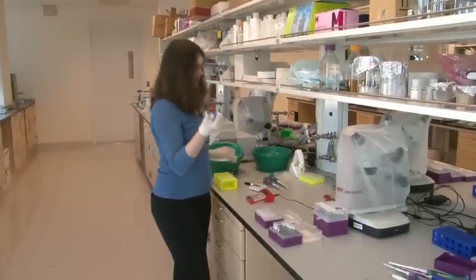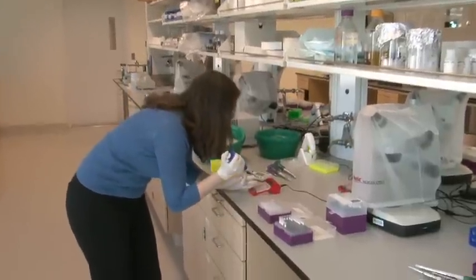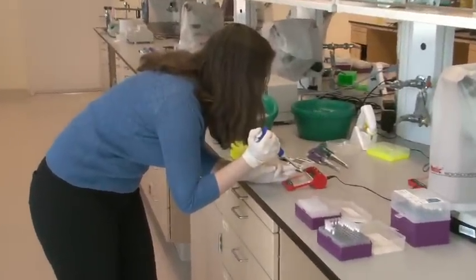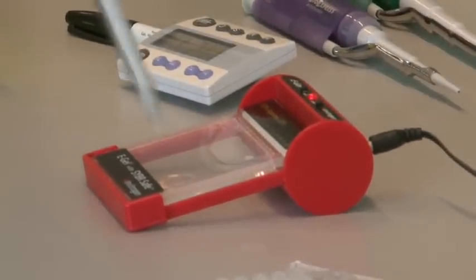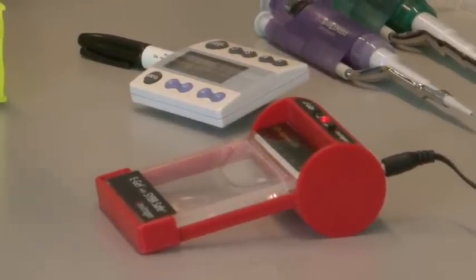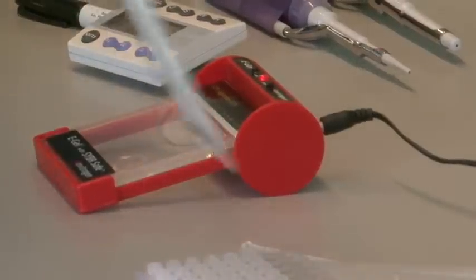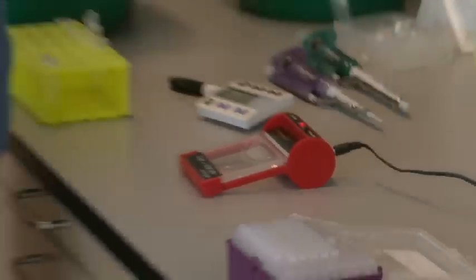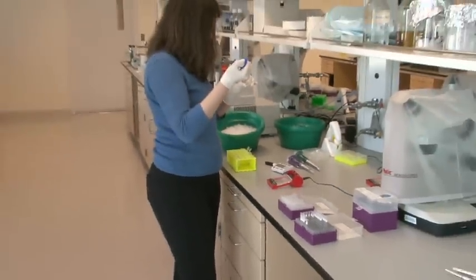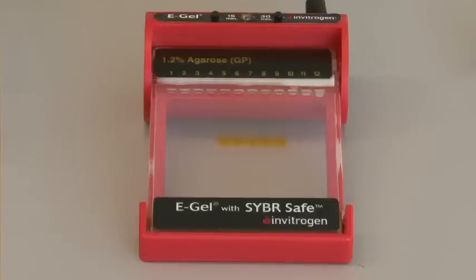And for each one of my DNA samples, I'm going to load them into one hole in the gel, sorry. So I'm loading my DNA samples of the different people individually into each hole in the gel. And the orange dye helps me to see that I've actually successfully gotten the DNA into the hole.